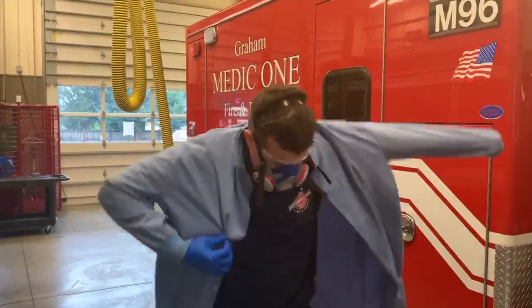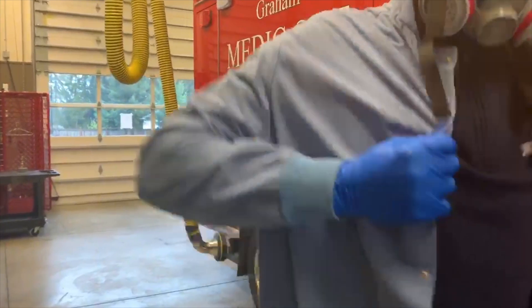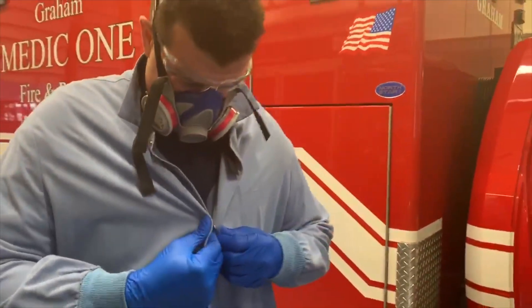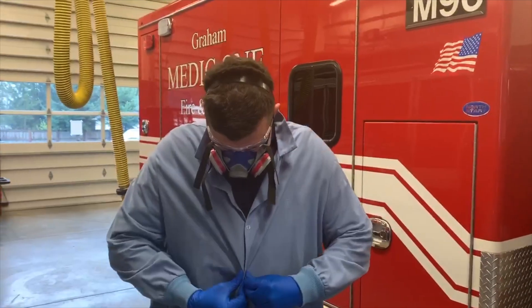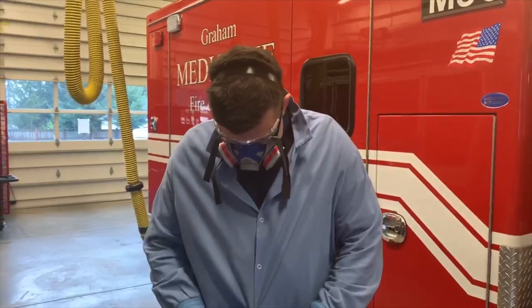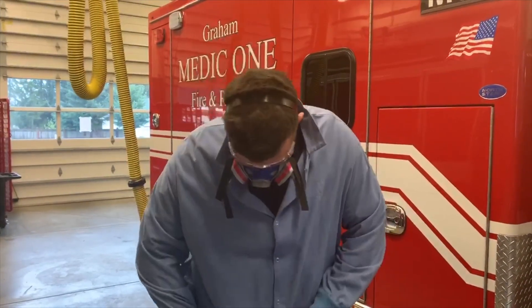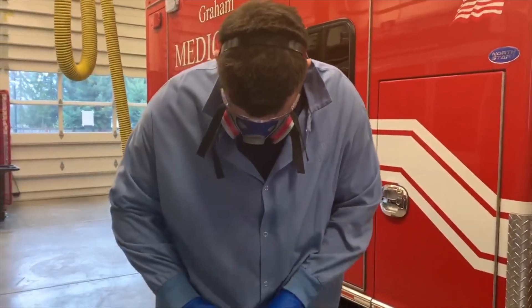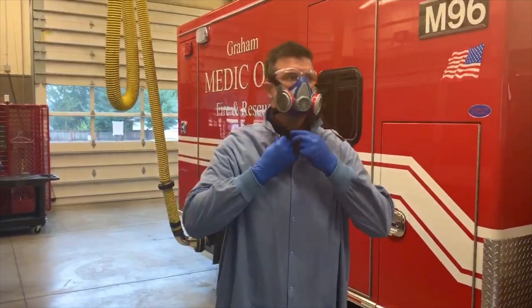The lab coat is very simple — it goes on like any other coat. It has elastic cuffs right at the wristlets and snaps. Our plan is to wear these coats on every call, as this gives the same amount or more protection than our current isolation gowns. Before we go into a call we'll have our mask, our glasses, and our two pairs of gloves on. We'll snap the coat up and go on with our call to take care of the public.